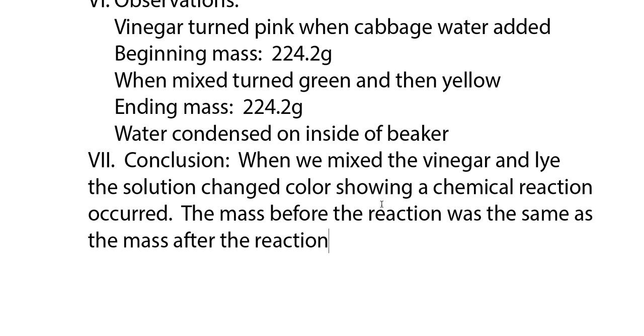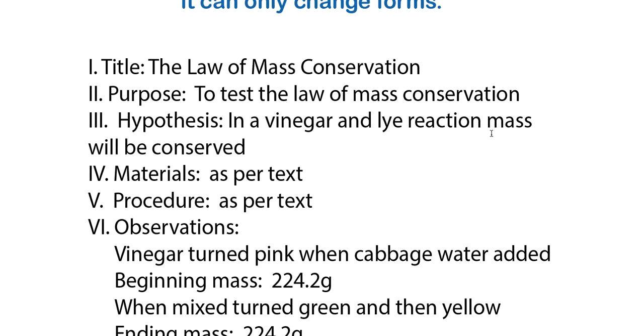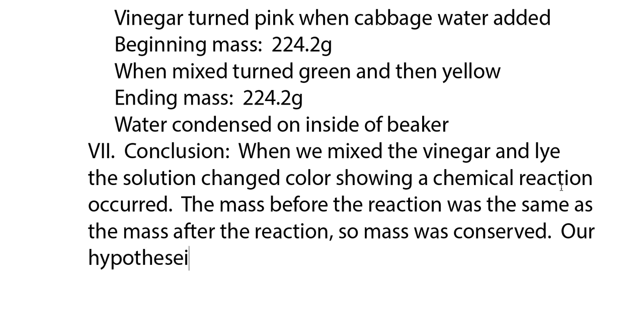So now we address our hypothesis. Our hypothesis was, in a vinegar and lye reaction, mass will be conserved. So if the mass before the reaction was the same as the mass after reaction, mass was conserved. We didn't lose any mass, we didn't gain any mass. Our hypothesis was correct. Okay. So in our conclusion, we kind of restate what happened.